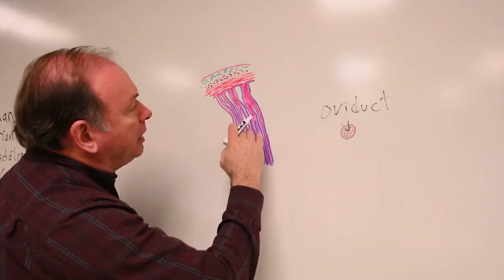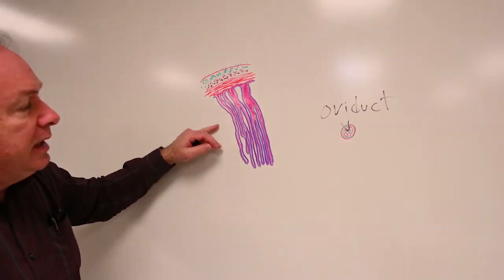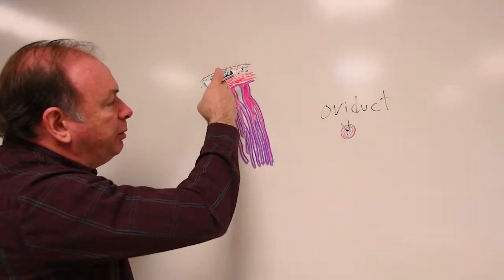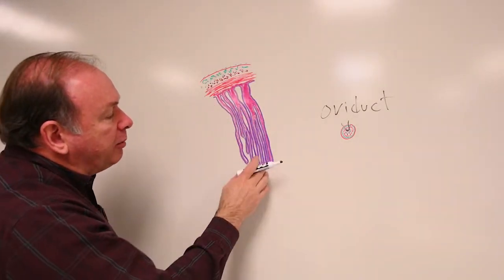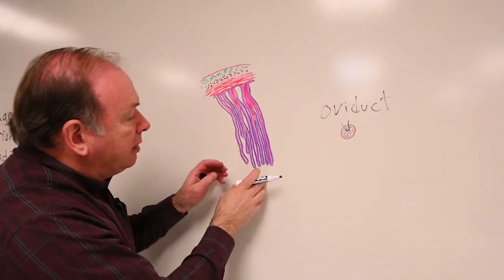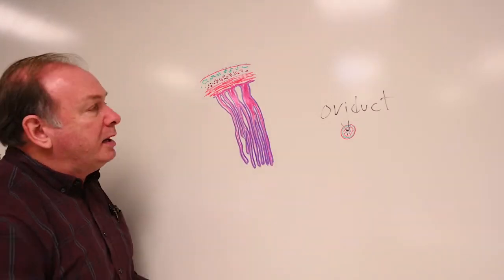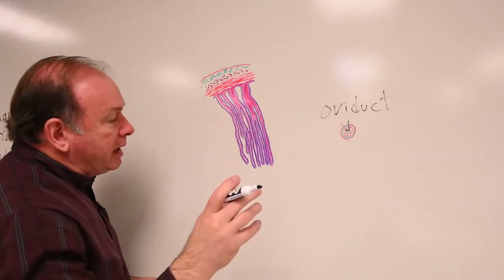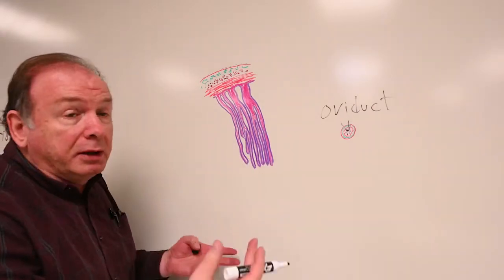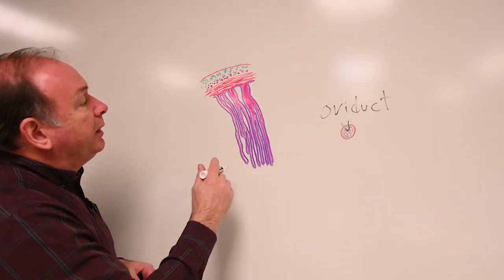look at the wall and the materials that make that up, we have a mucosa that's thrown into these ridiculously long, narrow folds on the inside. These sheets come in from the outside toward the middle. It's almost like there's no lumen or cavity on the inside at all. There's no open space down here because they all kind of overlap all the way around the wall of the oviduct. And the egg cell is supposed to pass through all of that on the way to the uterus. And it works. But anyway, it doesn't look like there's any room for things to move through there.